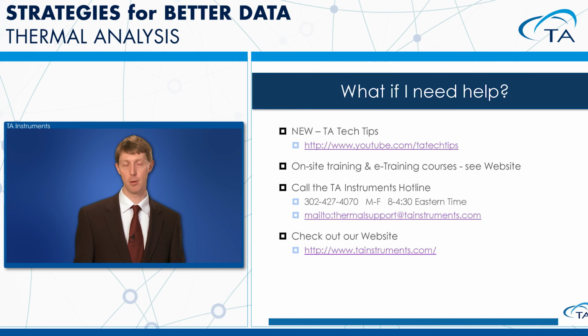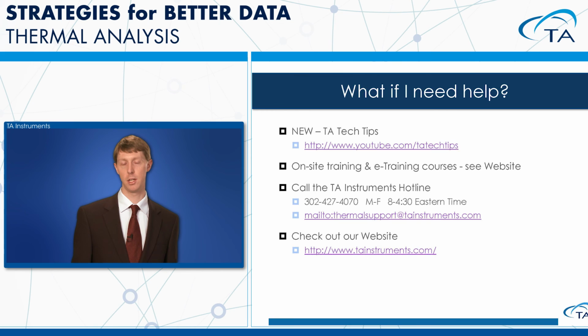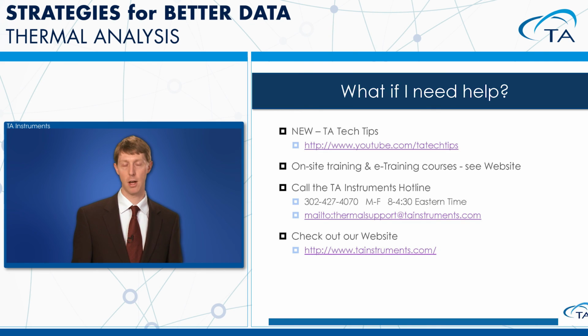And finally, if you need help, and you've gone through the courses and you've sat through the seminars and you've looked at the TA Tech Tips and you still need help interpreting data, or you need help figuring out how to do a certain task with either the software or the instruments, or calibrating the instruments, there's always the hotline that's available. You have a phone number that you can call between 8 and 4:30 Eastern Time, and there's always an email address that you can send questions to as well. Obviously, the email questions are only going to be addressed between 8 and 4:30 Eastern Time, but at least you can send data sets in, send presentations, send pieces of information that you might need help in interpreting.